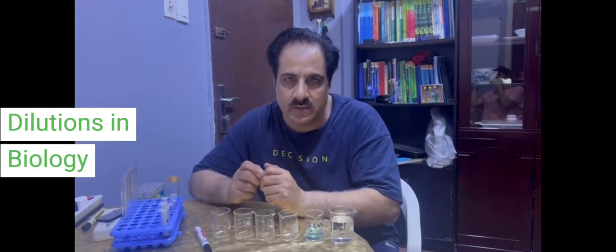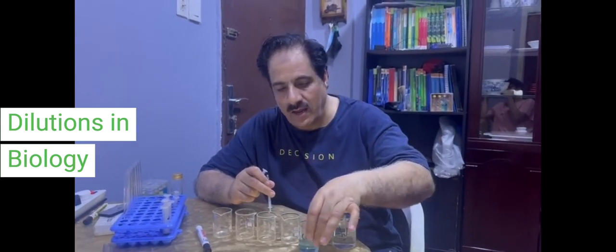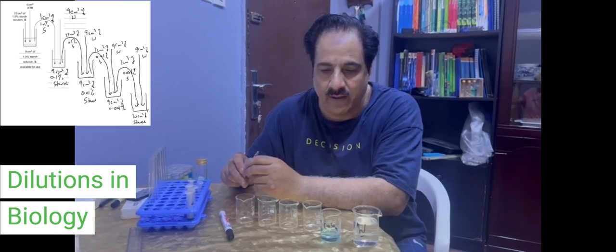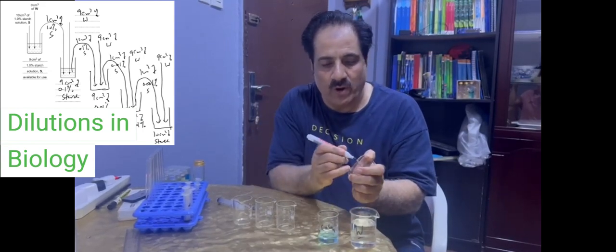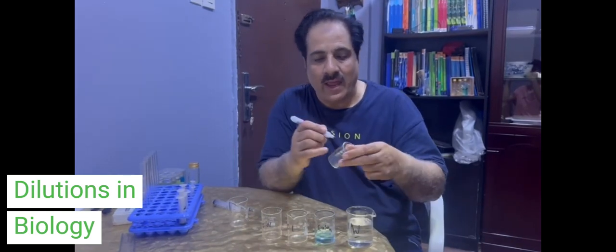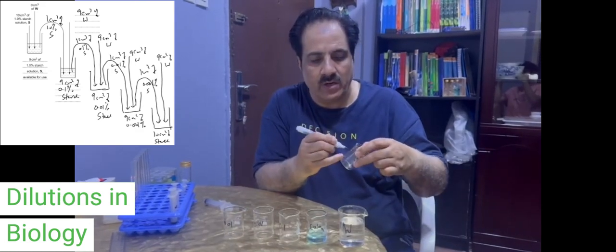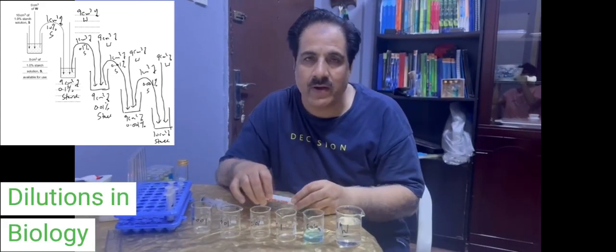So the first dilution is that we have been given a 1% copper sulfate solution. We call this the stock solution. And there is W, which is the distilled water with us. And we have to reduce the concentration of this solution by the factor 10. That means when we divide 1% by 10, it will become 0.1. The second will be 0.01, because when we divide 0.1 by 10, it will be 0.01. And this will be 0.001. And the last one will be 0.0001. This means we are decreasing the concentration successively by a factor of 10.